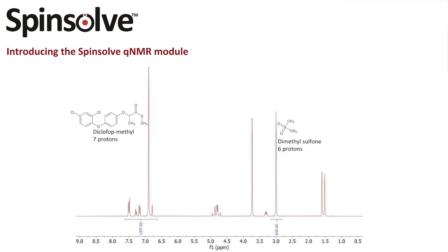For this demonstration I'm going to use Diclofob Methyl with Dimethylsulfone as internal standard. We already used this sample in our blog post about QNMR on Spinsolve Benchtop NMR spectrometer. Here you can see a previously recorded 1D proton spectrum with the integral regions which we are using for assay determination of Diclofob Methyl.